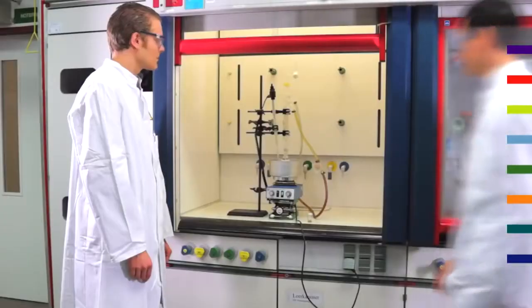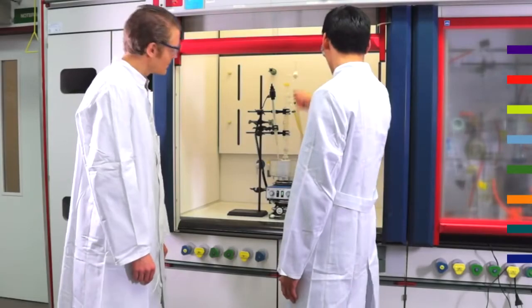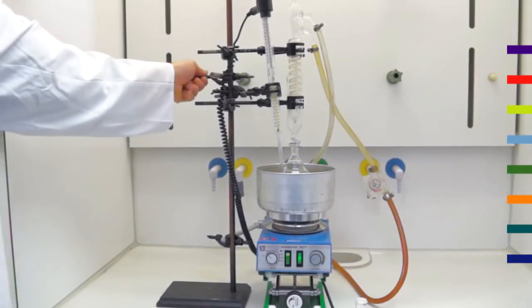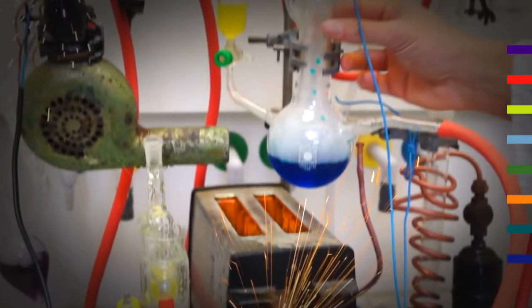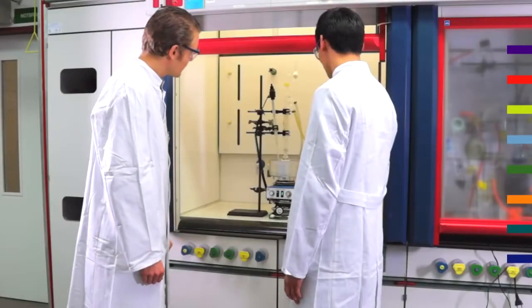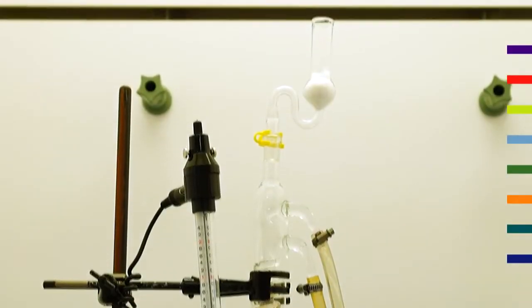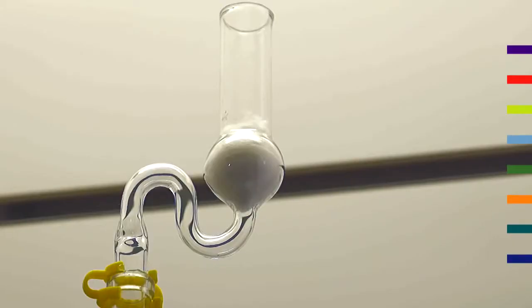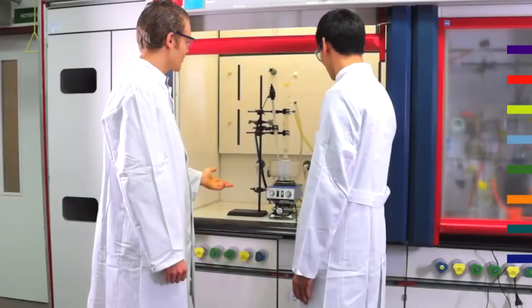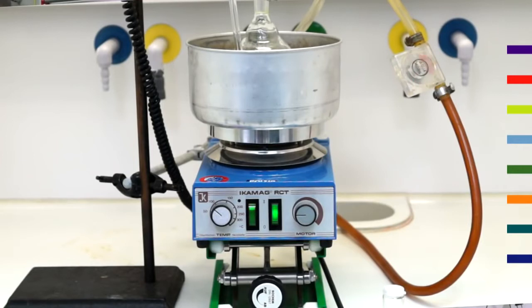When a chemical apparatus is assembled and used, special care must be taken. When doing this, there's no need to be creative, and improvisations are not welcome. The apparatus needs to be well constructed with no tension, and it needs to be stable. Every apparatus requires a pressure vent. You must not assemble a closed apparatus, because this may lead to a dangerous surge in pressure.